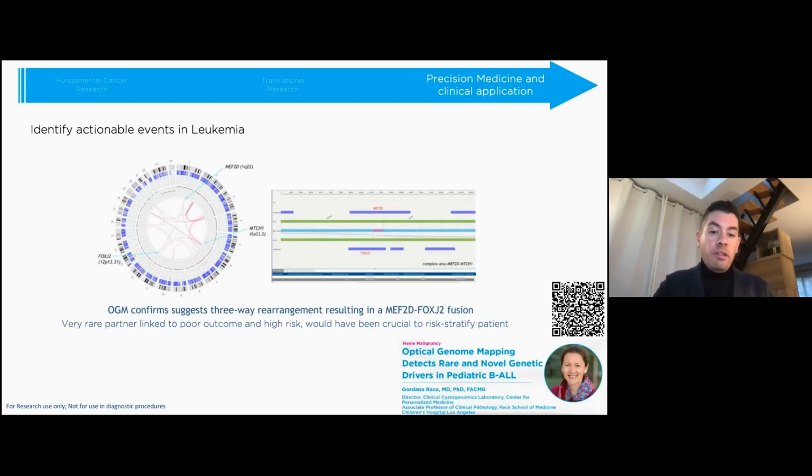And the clinical significance is that MEF2D fusions are associated with higher risk disease and very poor outcome, explaining the aggressive cancer in this patient. And that information would have been crucial to risk stratify this patient.